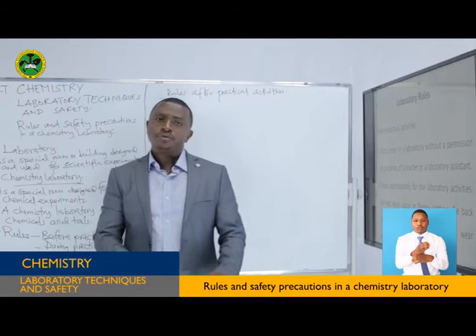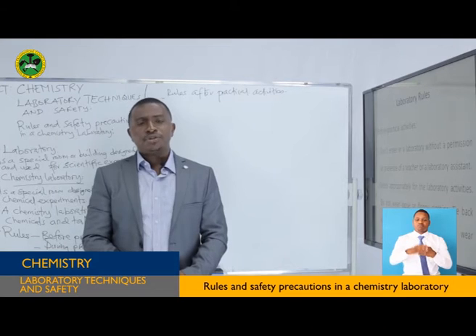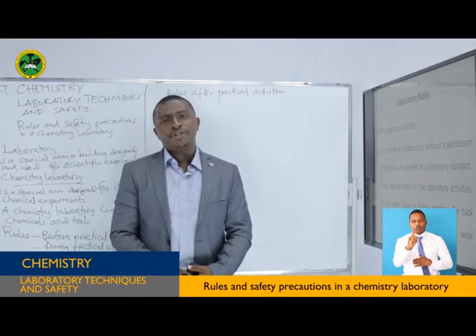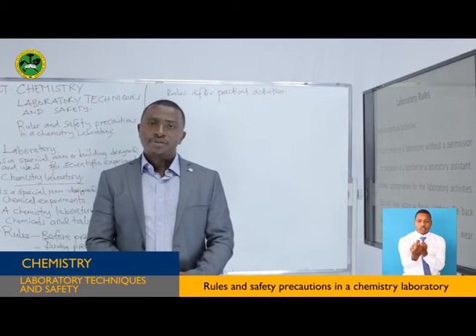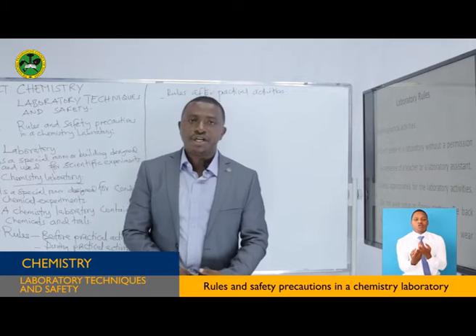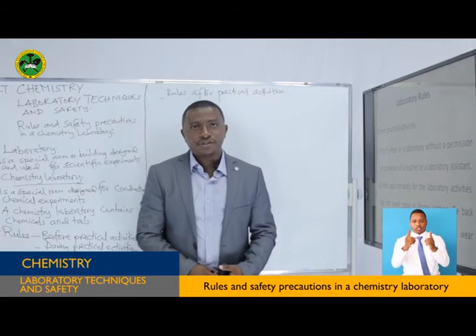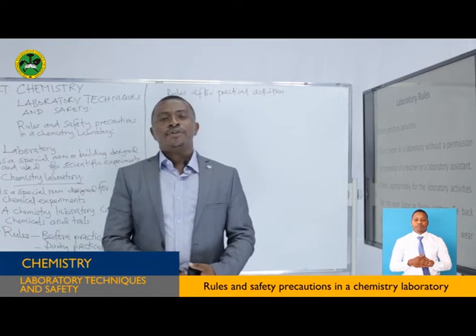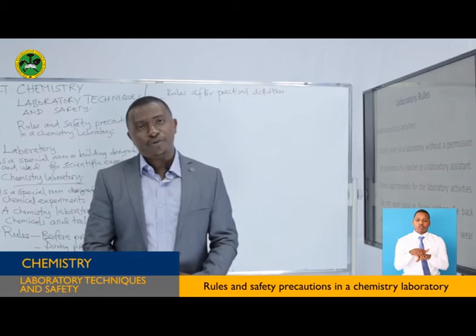So when you students are prepared for the practical session, don't just enter the laboratory without permission. Wait for the permission from your laboratory assistant, from either the technician or the subject teacher concerned, and wait for the instructions on what type of experiment you are going to perform.